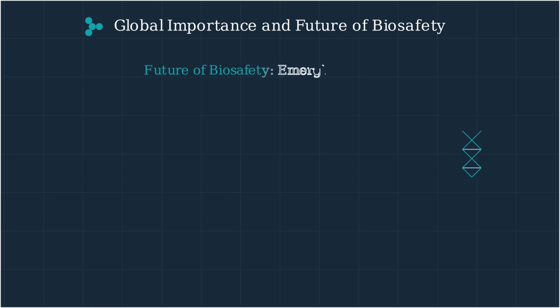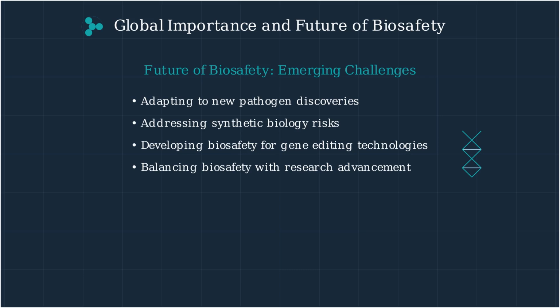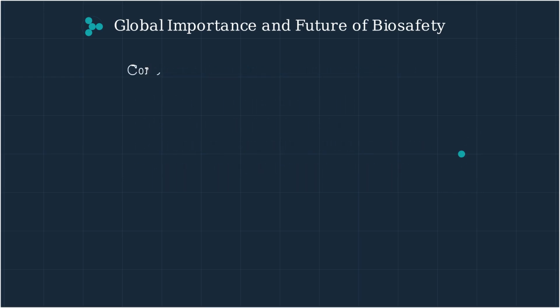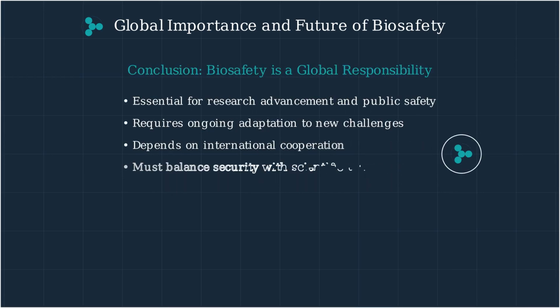As research advances, biosafety protocols must evolve to address new challenges. These include adapting to newly discovered pathogens, addressing synthetic biology risks, developing protocols for gene editing technologies, and balancing safety with scientific progress. In conclusion, biosafety is a global responsibility essential for both scientific advancement and public health protection.